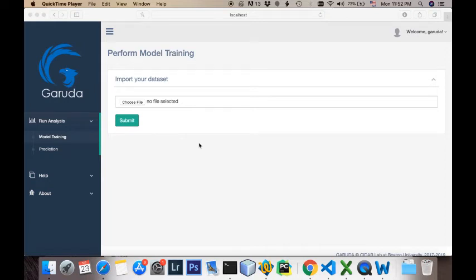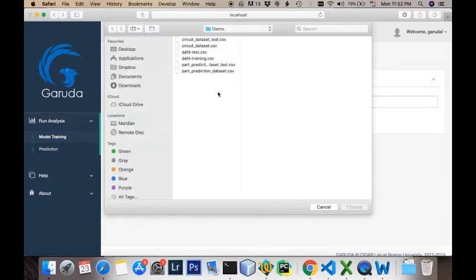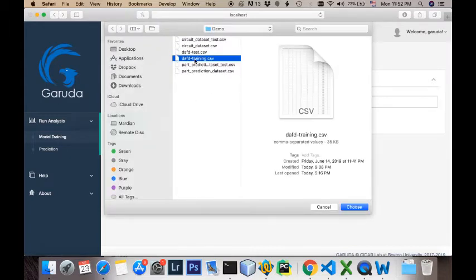In this video, I'm going to show how to use Garuda to train machine learning models, deploy the training results, and use those deployed models to make predictions out of a new dataset. To train models, first we need to provide training data, which in this case I'm going to use Ali's data for his DevD project.